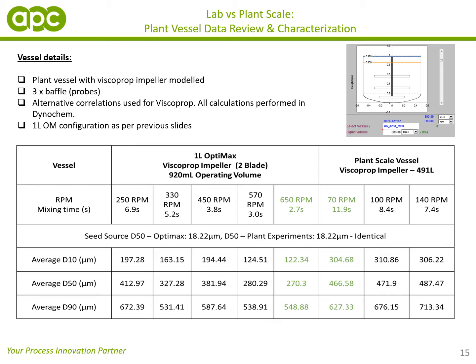And again, this just points to the possibility of maybe shear or secondary nucleation occurring on the lab scale, that's causing this reduction in the D10.